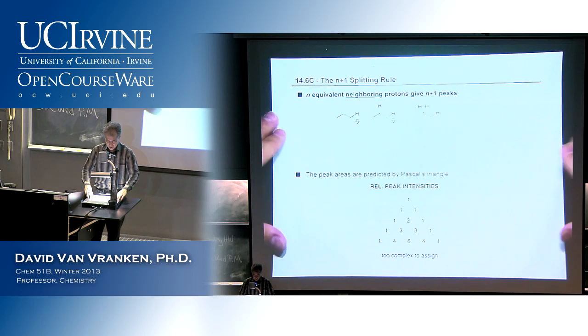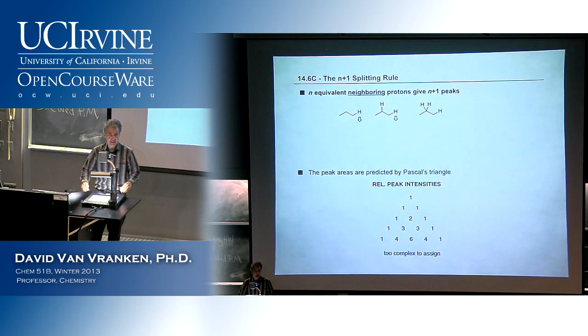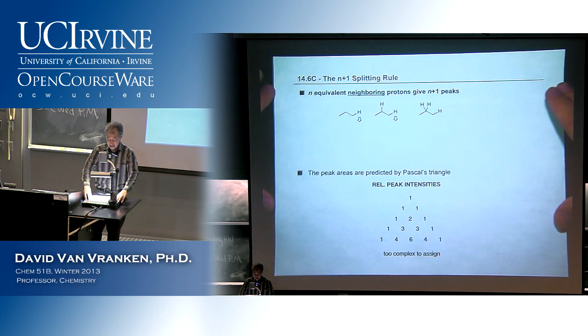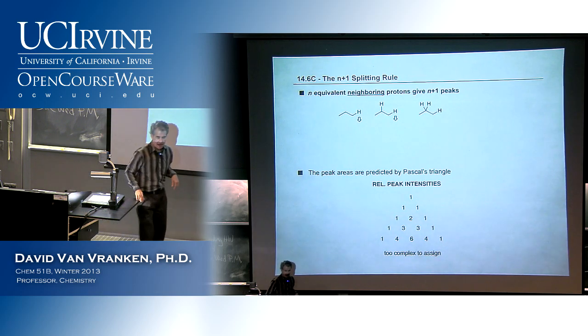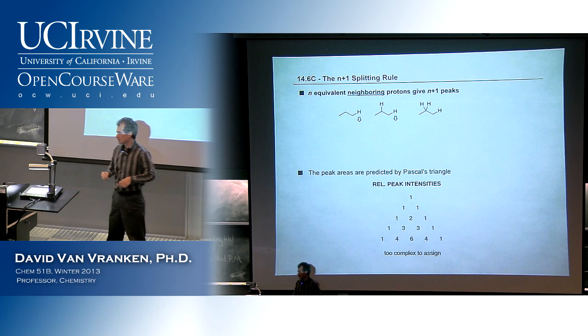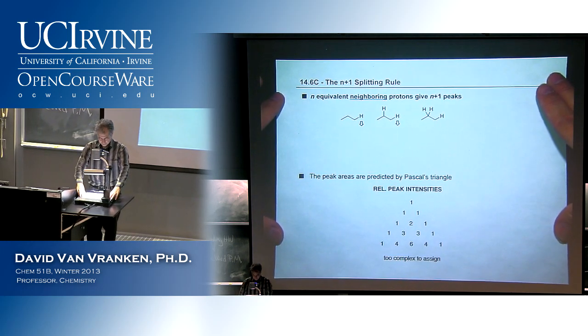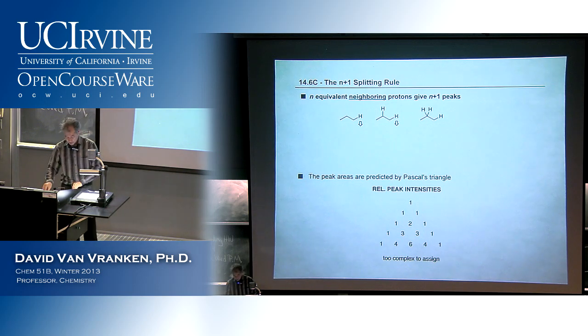And thank you for asking those questions, because even if I'm not ready to go into the details behind that, it means everybody else is wondering the same thing. This tiny little effect that I saved for last, right? We've covered 90% of NMR, but this tiny little effect of splitting is what makes proton NMR so challenging, and will create most of the work for you in terms of interpretation.